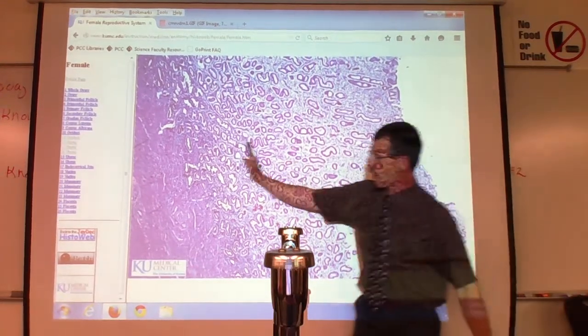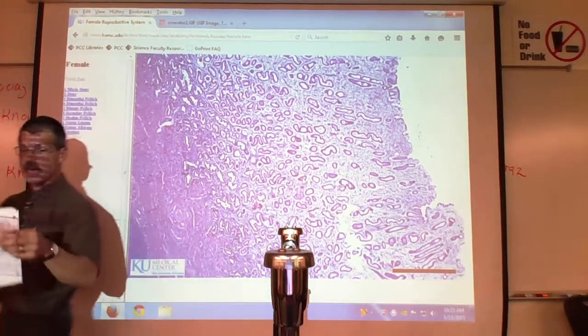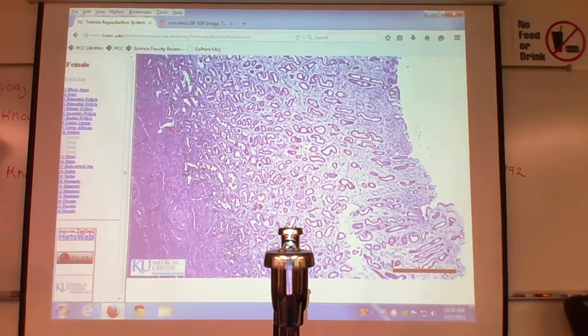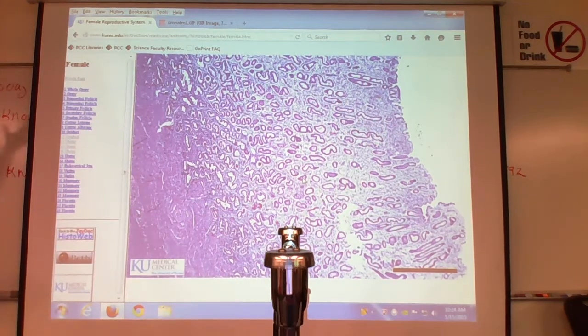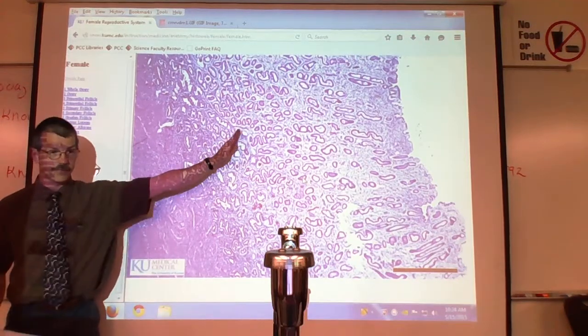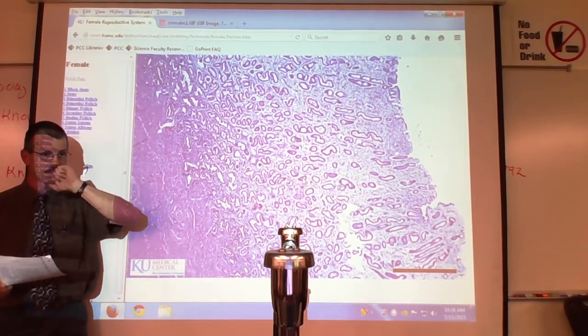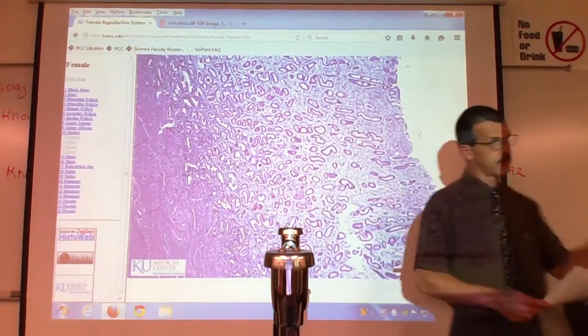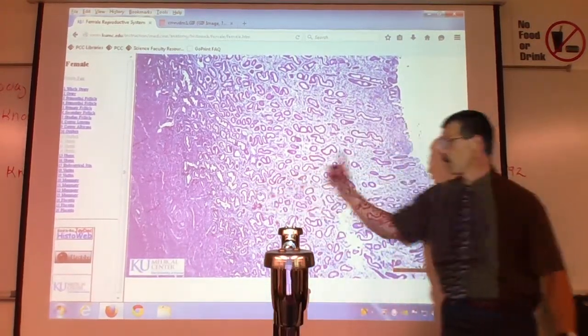This part stays behind, and therefore that part would be which layer? Basal. The basal, like your skin, basal layer upwards. So there's no line in the sand. You have to just eyeball that this part looks different from this part. So when you say sloughs off, you mean like with menstrual cycles? Yes. So you lose this when you menstruate. You keep that, and that makes more of this.